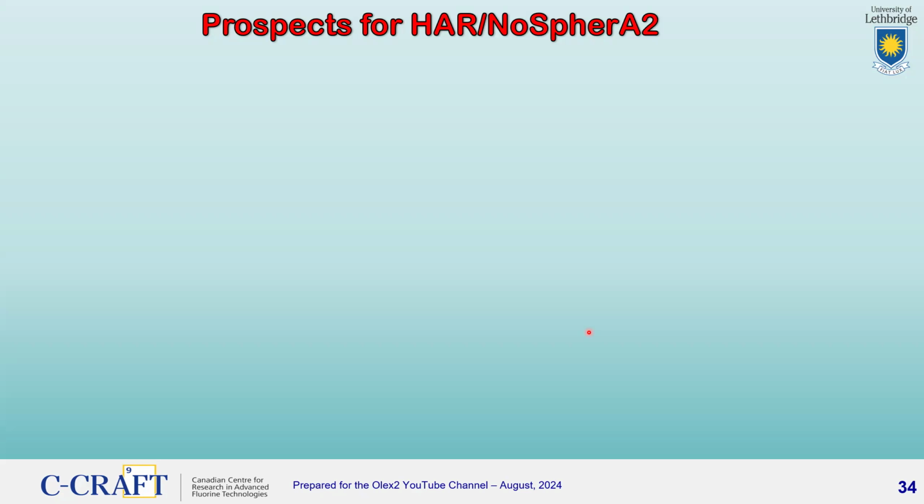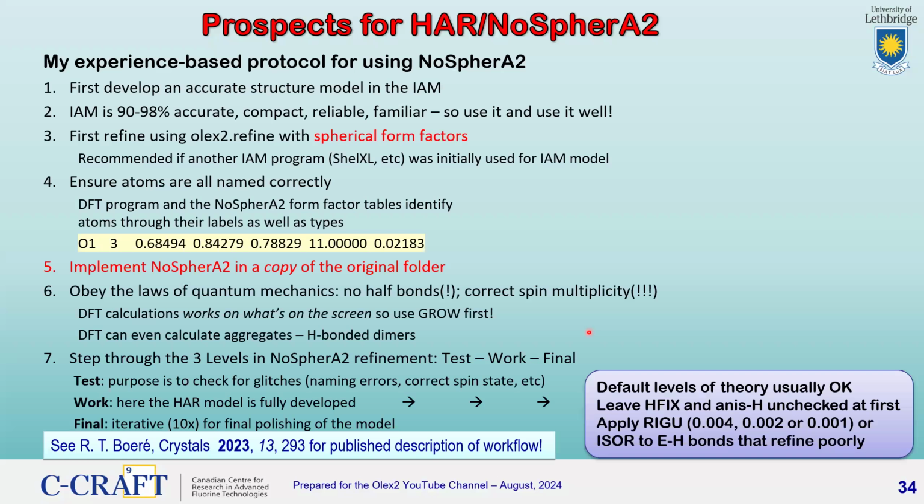What are the prospects for NoSpherA2? That's a very important question. I'll have to say, I think the prospects are outstanding. It's a superb piece of software. I thought I'd start by just quickly going through my experience-based protocol for using NoSpherA2. I won't go through this in great detail because we published that in detail.